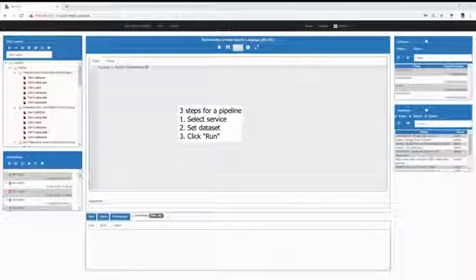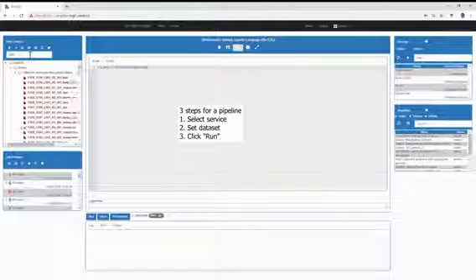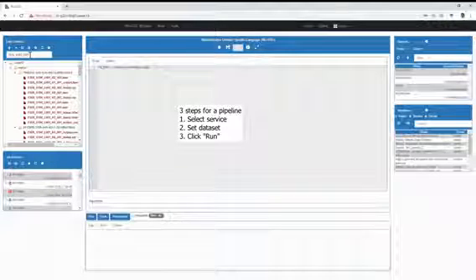A new item will be added to the top of your Job Histories panel. Double-click it. The Output tab at the bottom will show the quality of the report of the sequence file. Click it to visualize it on the browser. Now you could download the result and look at the quality of your report.